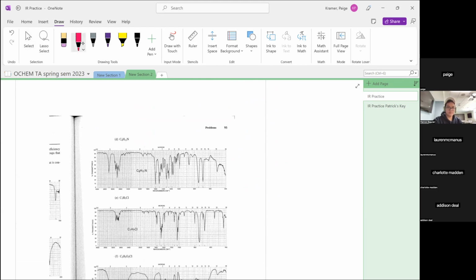All right, this one's a little bit tricky using our flowchart. I'm thinking we probably should update it because the amines are not on the flowchart, so pending, we can do that. But we don't have a C double bonded O, we don't have an OH, we have no CO, so usually we would call that a hydrocarbon, right? But we have evidence of another functional group.